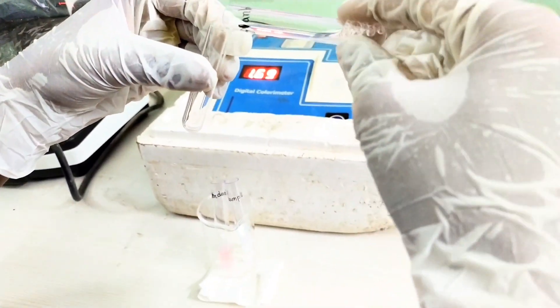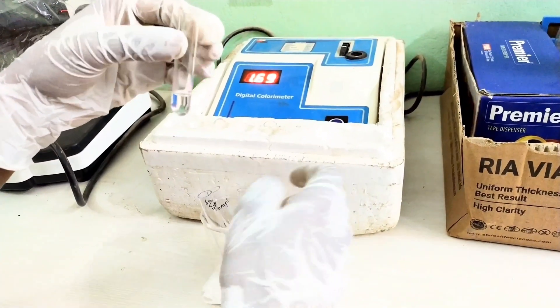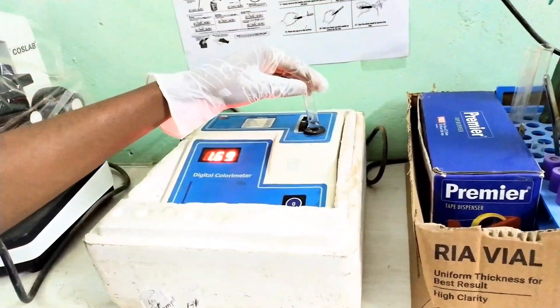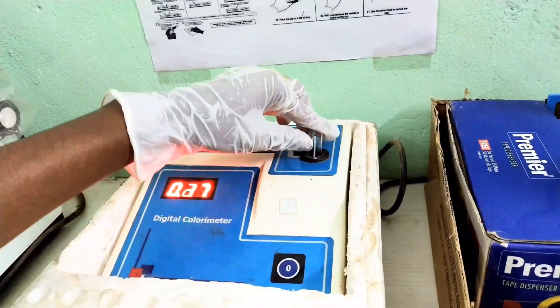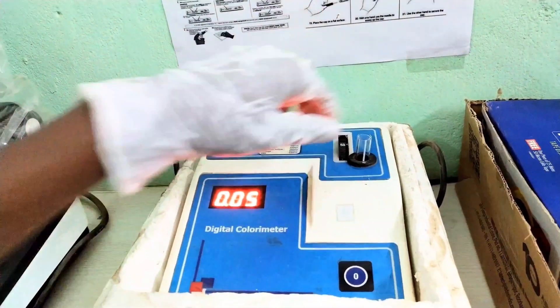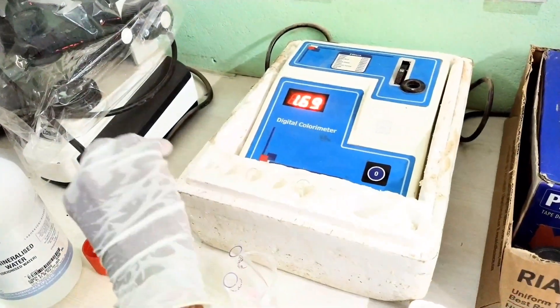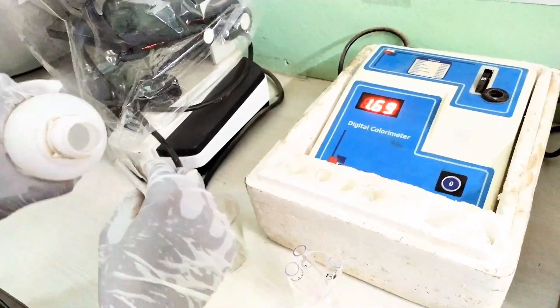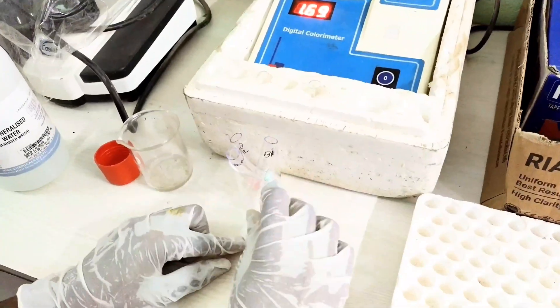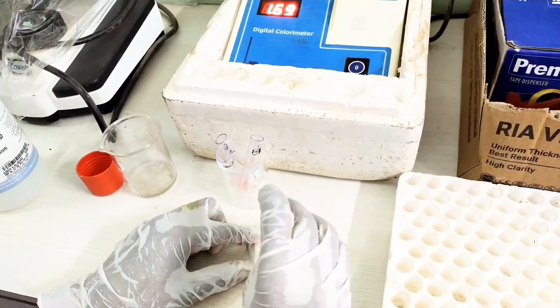Now take the blank sample reading. One by one, clean the glass test tube well with distilled water and tap on tissue paper.